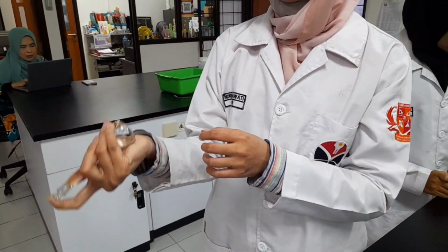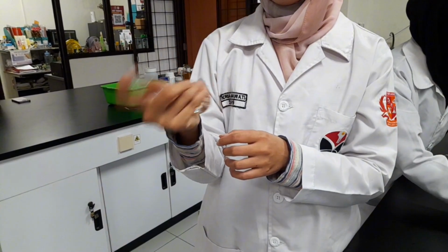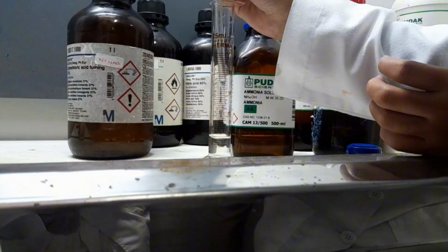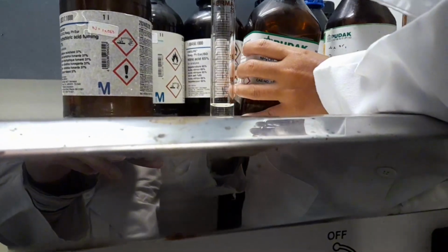Lastly, we need to shake the volumetric flask at least 20 times, and then the solution is ready to use. Do the same for the other compounds, including the ammonium hydroxide, but because it's liquid, we use a different formula to get the amount we need.